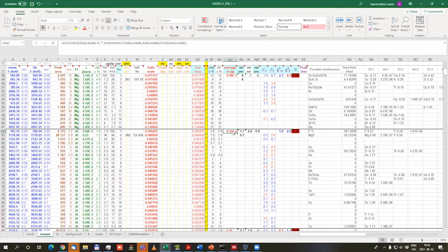But if you check out, so this is 4.10. If I put this back, it will be 4.11. So only tiny changes are made by these outliers. And in most of the cases, the analysis is very reliable.